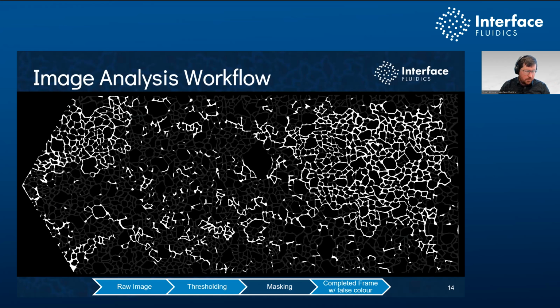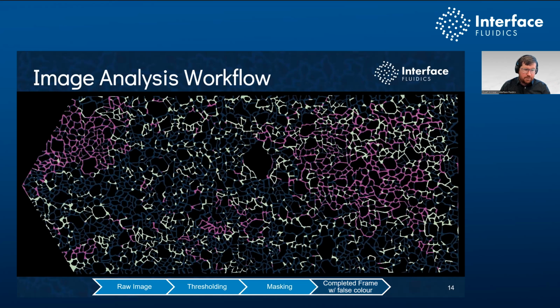And then to help interpret those data, we then go in and add false colors to give our human brains a little bit of a better chance to interpret what we're looking at. Because there's one thing we've learned at Interface is that humans are terrible at looking at a picture and understanding and quantifying what's going on, and machines are great at it. So this completed false color process is actually more of a process for helping us, as folks that need to interpret these results, look at it and understand what's happening.